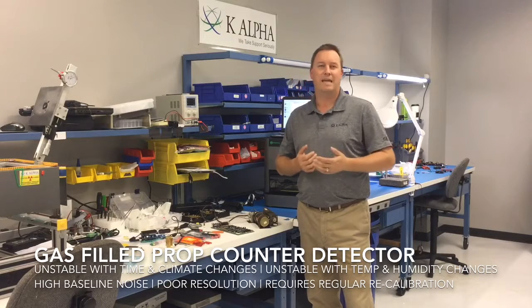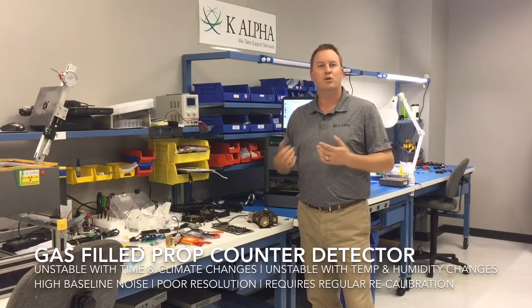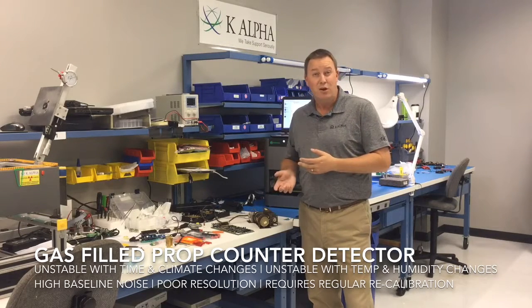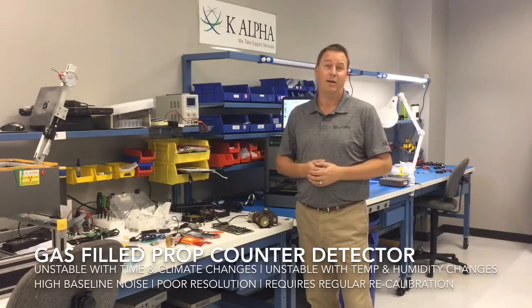Also, they aren't very stable over time. Since it's a gas-filled detector, fluctuations in temperature and humidity, or a slow leak over time, are just going to lead to inconsistencies in your data. You're going to have to recalibrate a lot.